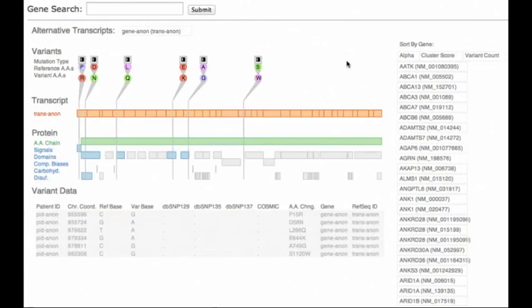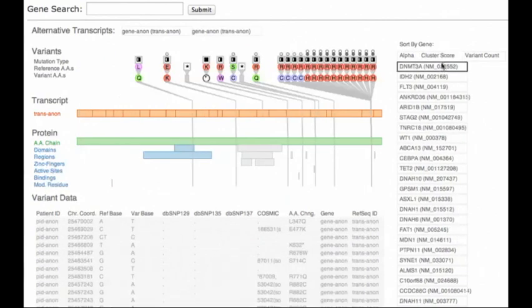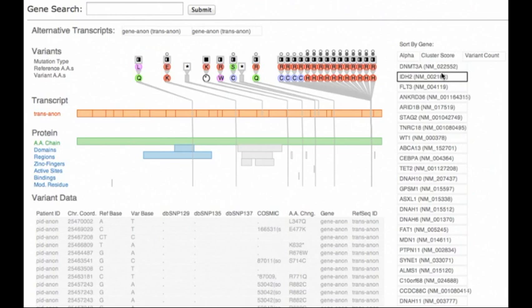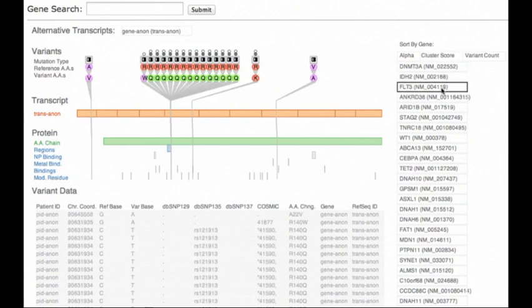We reorder the list by cluster hotspot metric, a derived measure guiding us to genes known to contain harmful variants. Many of the genes known to be implicated in this disease are now near the top.